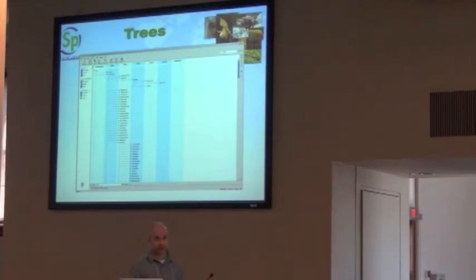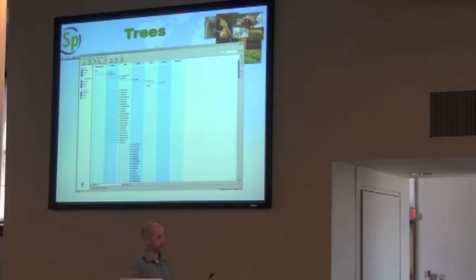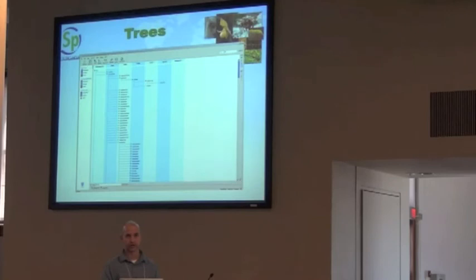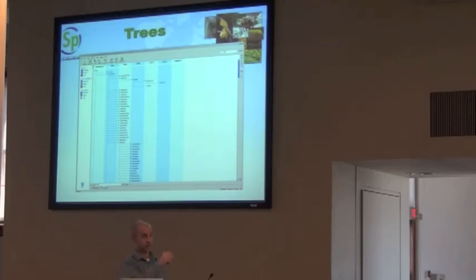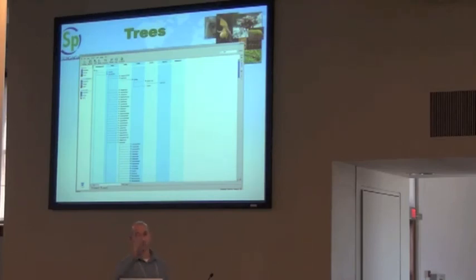There's a bunch of data stored in Specify trees — authority trees. You have taxonomic information, geography information, and storage information — exactly where all of your specimens are stored within your institution: the building, the room, the shelf, the box, the vial, the rack, etc. The taxonomic tree has a number of levels built in and you can decide what those levels are for your scenario. There are three drag-and-drop functionalities within the trees to move, merge, or synonymize things. You can take an object and move it from one parent to another — for example, if a genus is in the wrong family, you move it to the correct family and it corrects all connected objects. You can also merge two things together — if someone entered a correct and incorrect spelling for a name, you can drag the incorrect spelling onto the correct one, merge them, and move all collection objects to the correct entry.